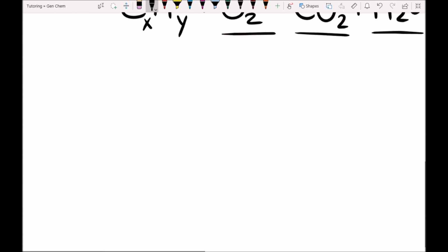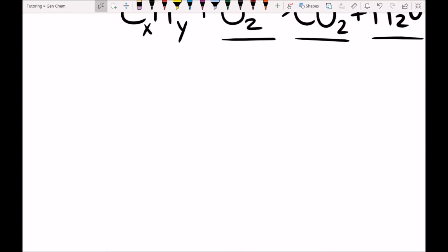So our combustion train has multiple different parts, and it works in a continuous flow format. So in from the left side, let's say, we have oxygen gas, because we need oxygen gas for combustion to happen. So we have oxygen flowing through this tube.